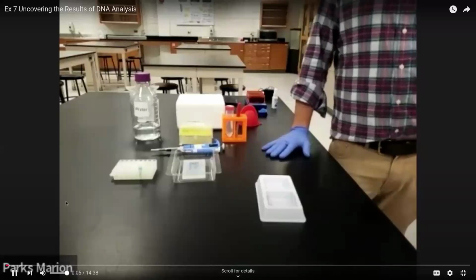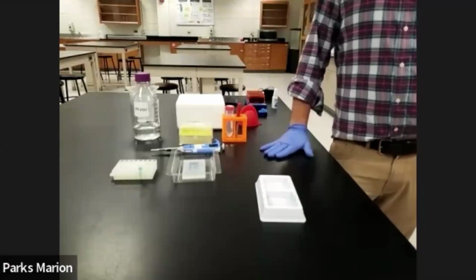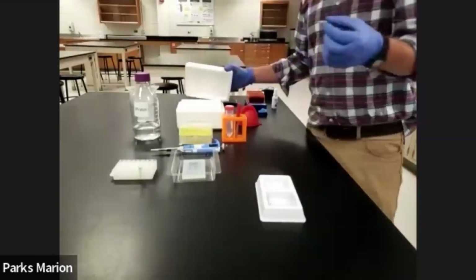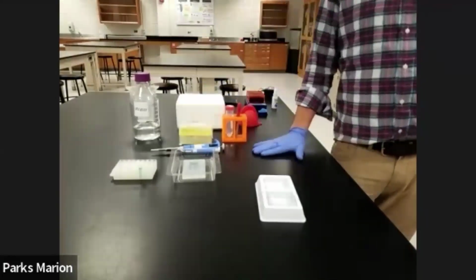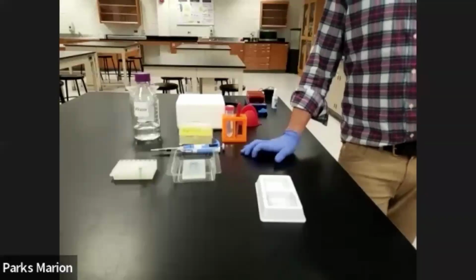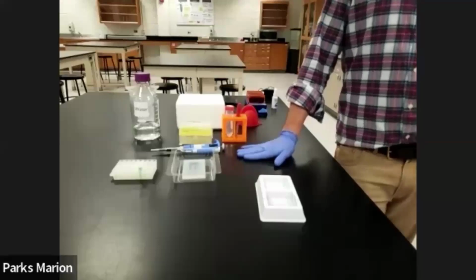Hello and welcome to Exercise 7, Uncovering the Results of DNA Analysis in Lab Protocol video. Today, we're going to look at the results from our PCR, which we conducted last week. You may remember creating these PCR products and then freezing them last week. Today, we're going to take a look at the differences in our PER3 genes from our instructors by visualizing those PCR products utilizing gel electrophoresis.